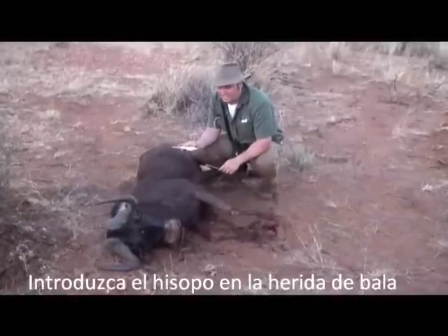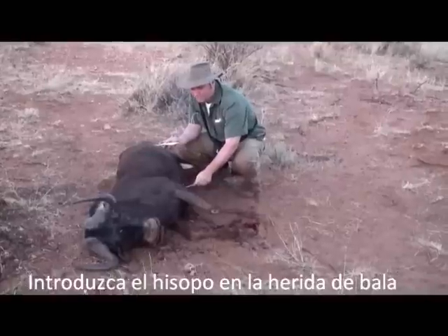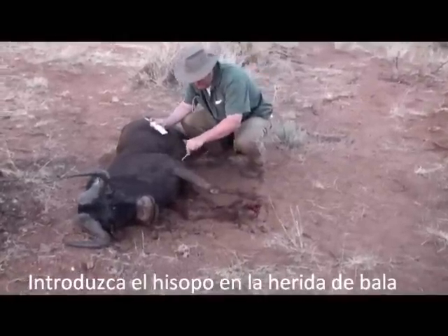Alright guys, we're here at Omievi Safaris. It's getting late in the evening and we just shot this monster black wildebeest, and we're gonna take a DNA sample now.